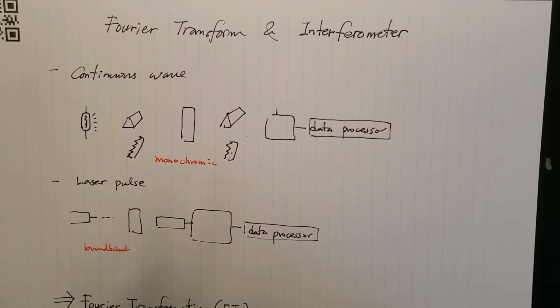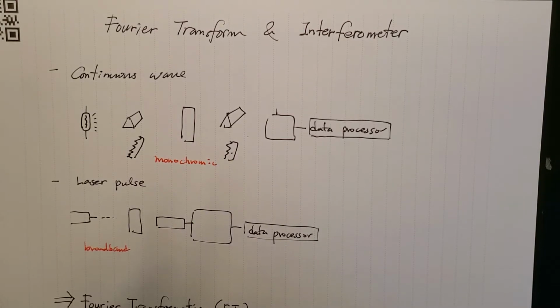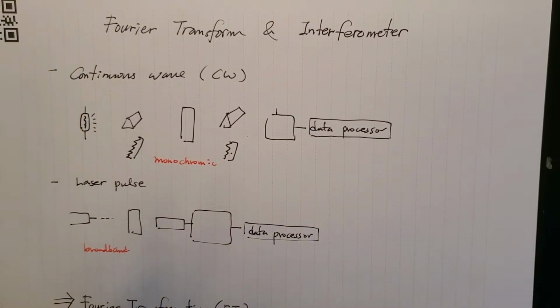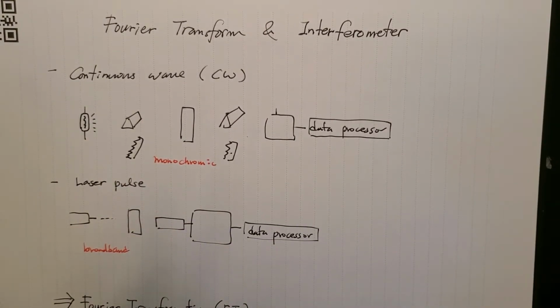We live in the 21st century, yet much volume of the textbooks teach with the concept of instruments from the age of continuous wave, CW light source. I might do that too because it's conceptually teaching us how the fundamental physics is actually helping us to discover the properties of chemicals.